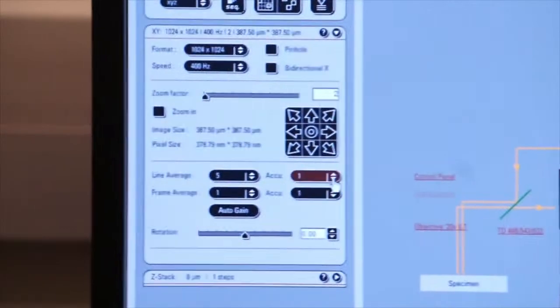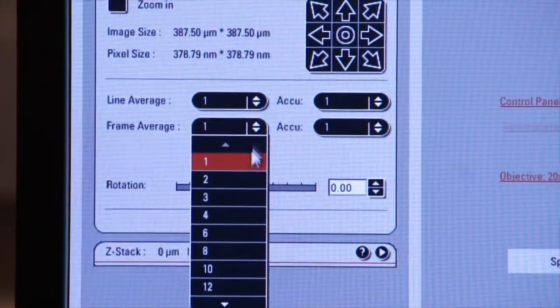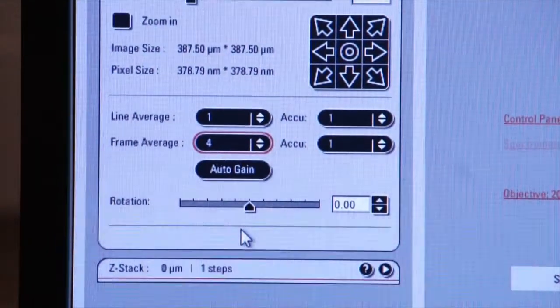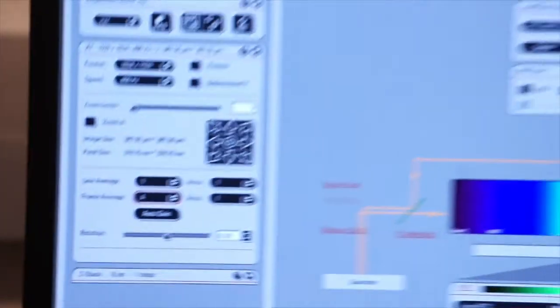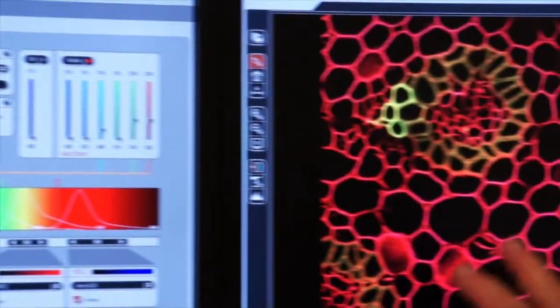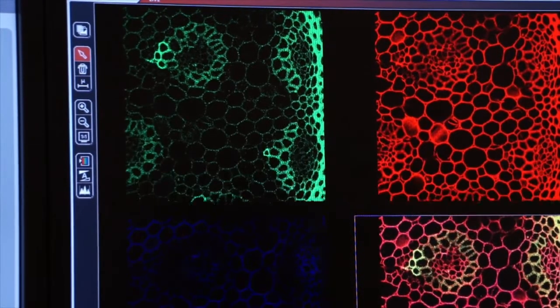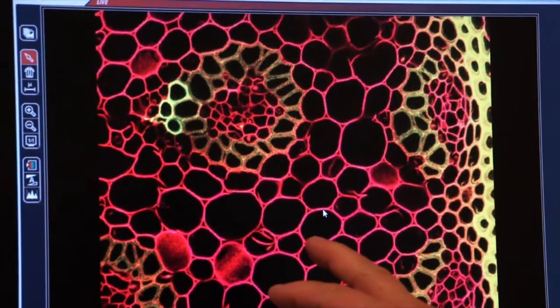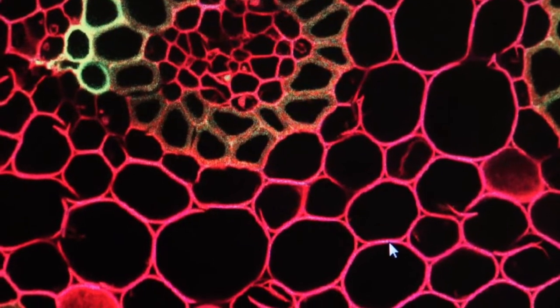Let's try that with frame averaging. We'll go back over here, we'll turn line averaging back to one and we'll take frame averaging, let's make it four frames. So now we're going to average each of four frames together. I'll click on capture image, watch the screen here and you'll see our high resolution image come up a little bit faster and a little bit grainier. So you can see that frame average is not as good as line averaging for producing a nice clean image.